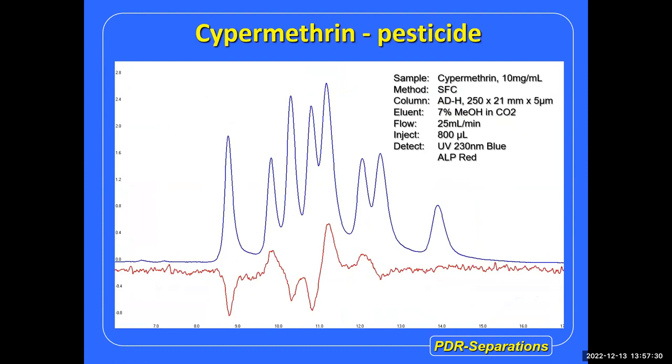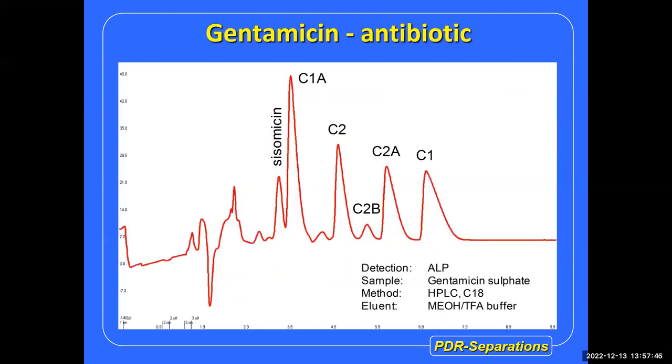Here's an example of a 3 chiral center job. You notice that these last 2 peaks in the UV are really not enantiomers. And you can see that because they're missing in the polarimeter trace. So you aren't chasing the wrong rabbit.